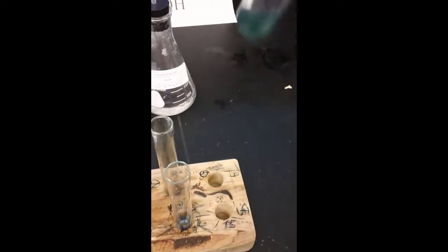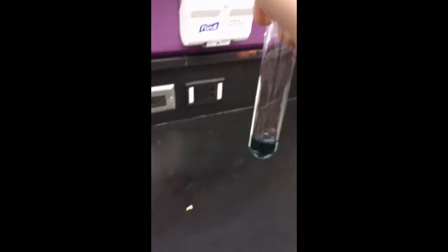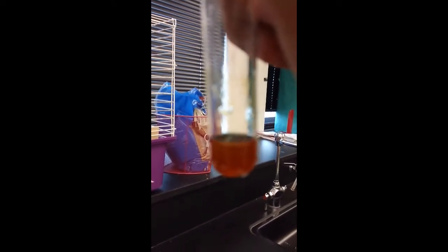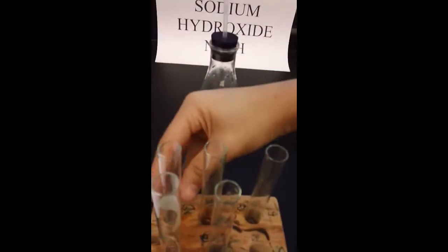So here we have the 5 drops of NaOH, and now we're going to mix them up a little bit. So this one's copper, Cr, chromium. So this is chromium. The next one we have is Fe. So you're writing down if you think there's a solid or not right now. The next one we're going to have is Zn.